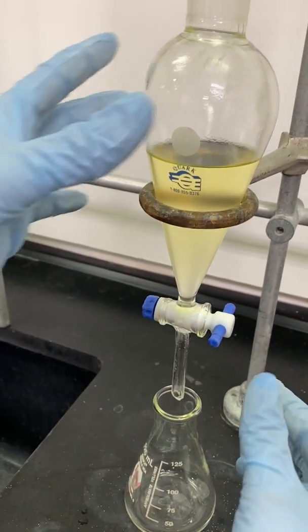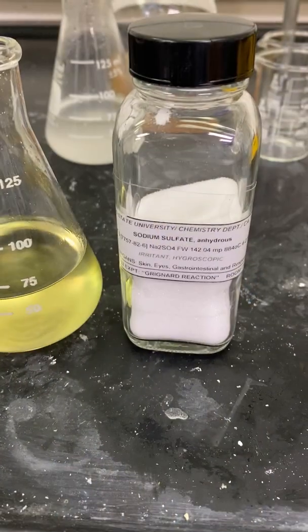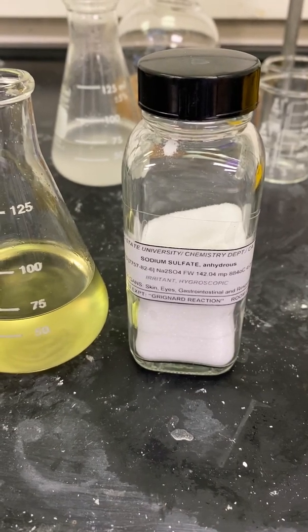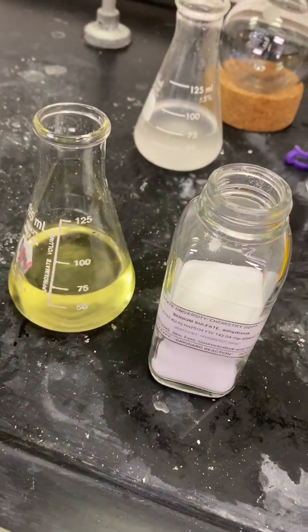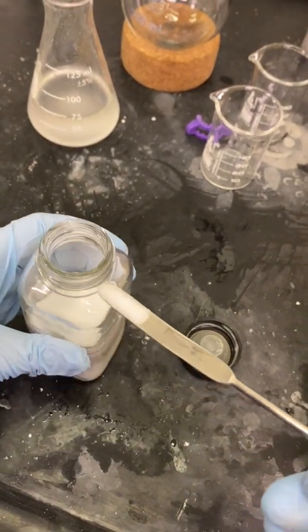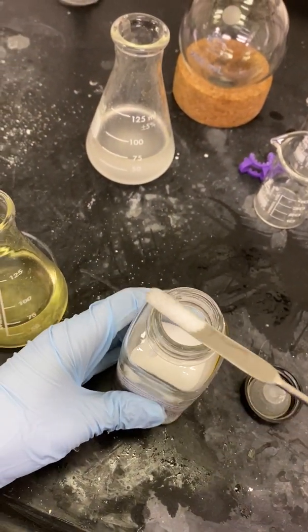I will now proceed to drain my organic layer into a separate 125 milliliter Erlenmeyer flask. I will now add some sodium sulfate to remove any water that might still be trapped in the organic layer. You do not need a lot of sodium sulfate — when you see that sodium sulfate is no longer clumping together and is mainly in free-floating particles, that means you have added enough to your organic layer.